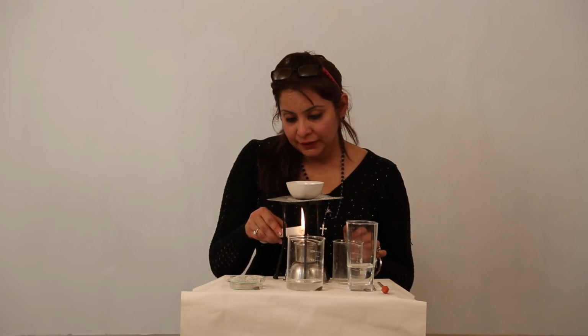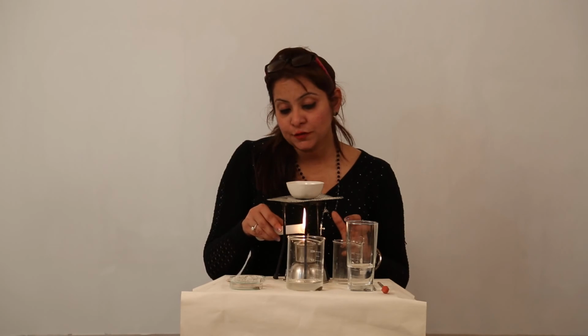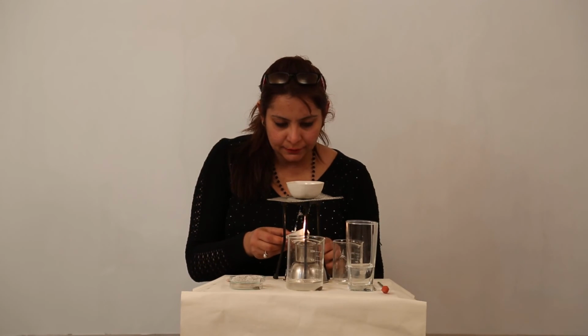It is actually a spirit lamp, because otherwise if it had been gas, it would not burn very easily, because it makes use of spirit, right. So we have just lighted it, right. The flame is just blowing. So we have just lighted it.